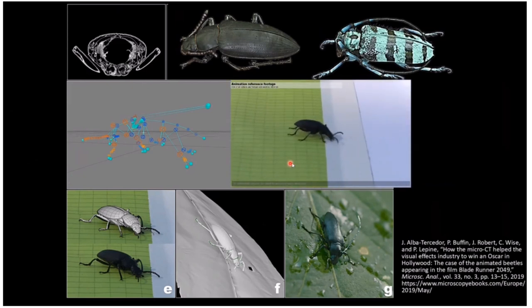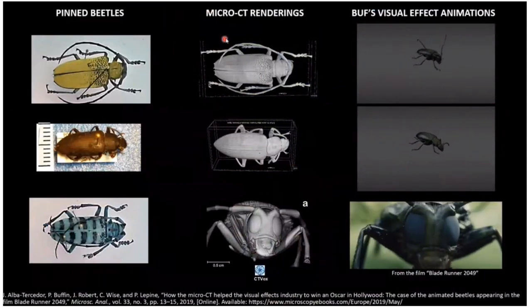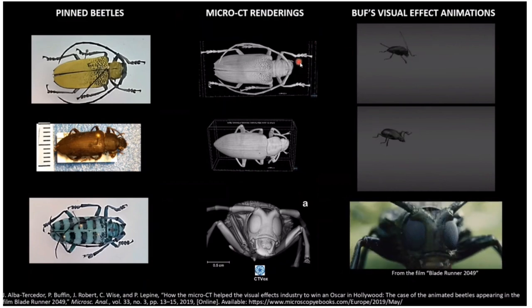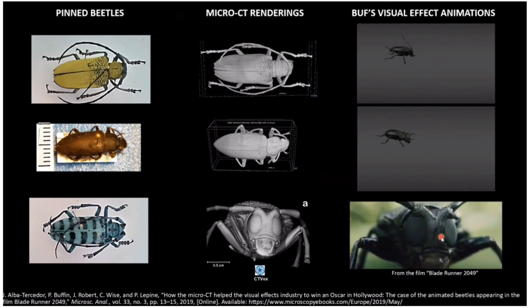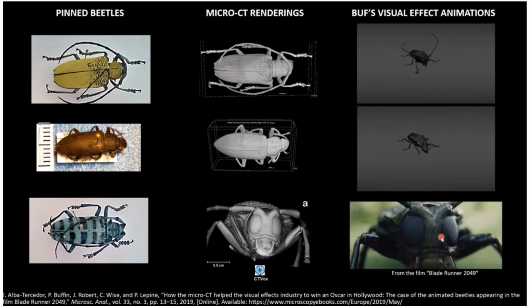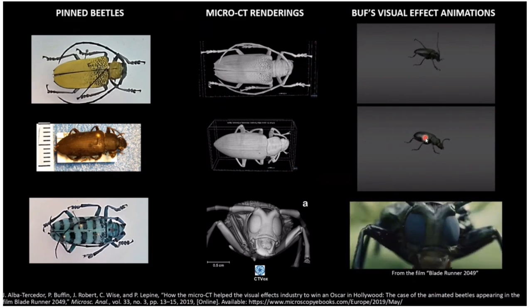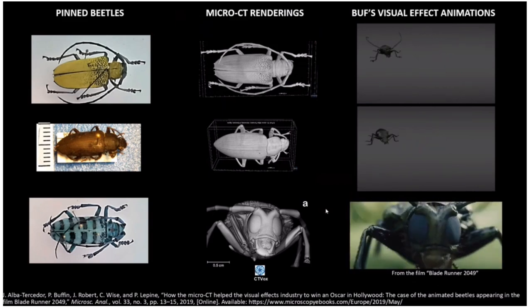And at the end, in the movie, appear something like that. So this is what I scanned. This is my rendering with CTVox, and these are the results that appear, the final result of the movie. So a lot of work for no more than 20 seconds in the movie. But they are really magicians. It's amazing how they could return to life this insect.